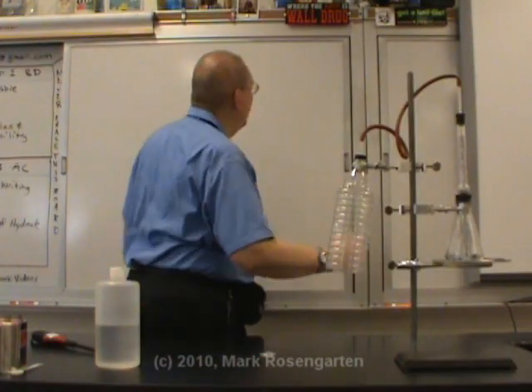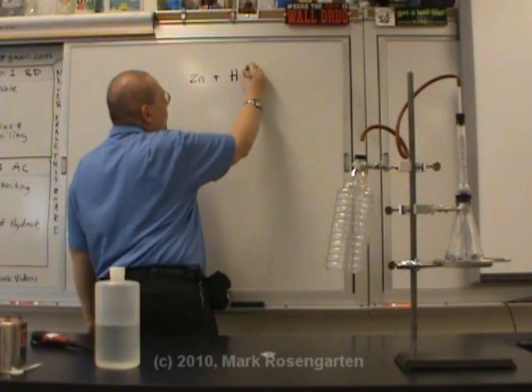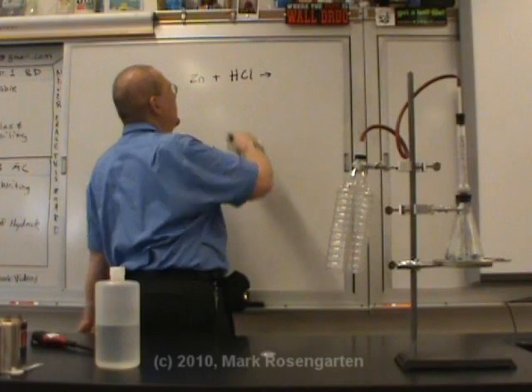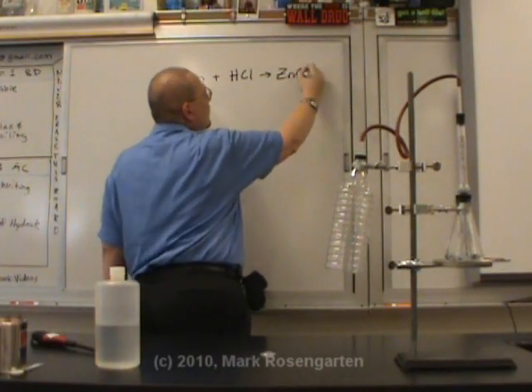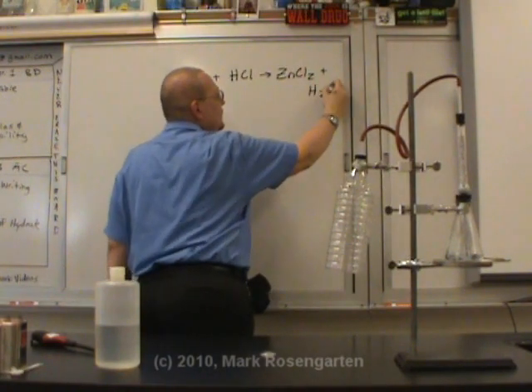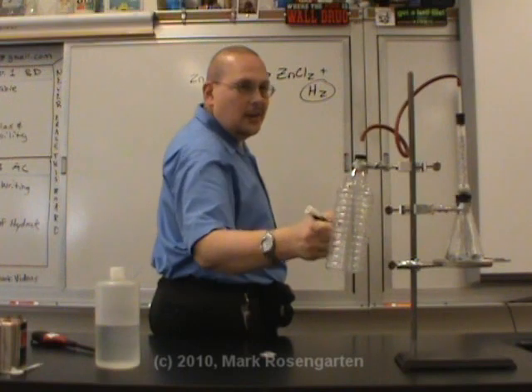What gas am I producing? I'm going to use zinc and hydrochloric acid. As this is a fairly standard single replacement reaction, the zinc and the chlorine will come together to make zinc chloride. And diatomic hydrogen gas will be given off through this tube, up into here, and trapped.